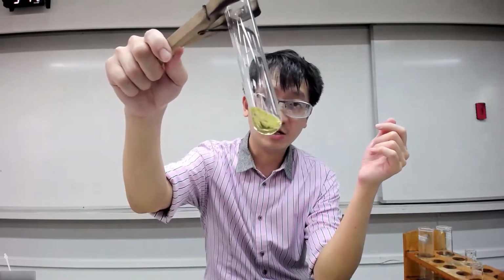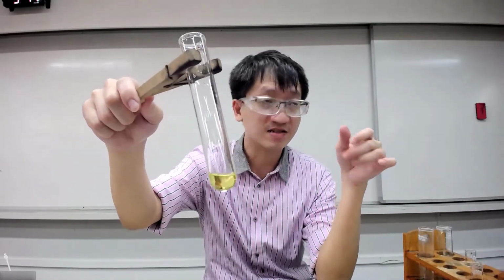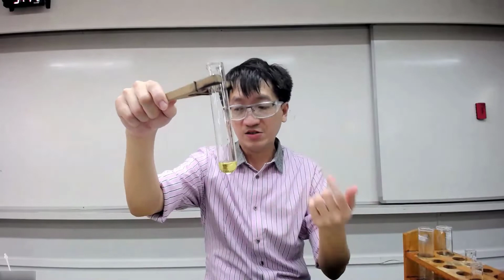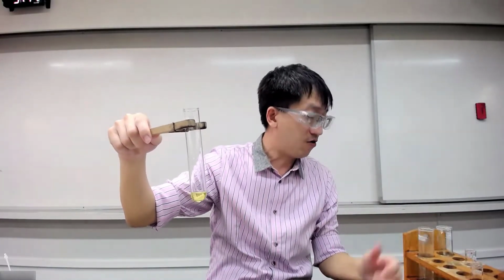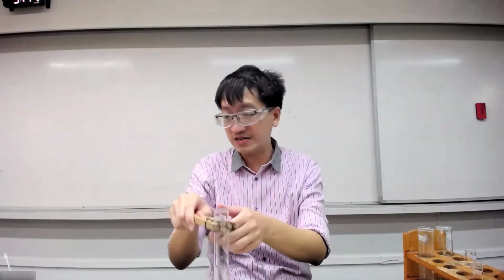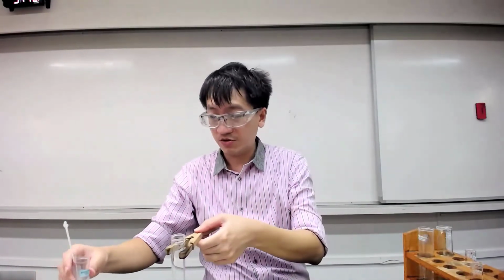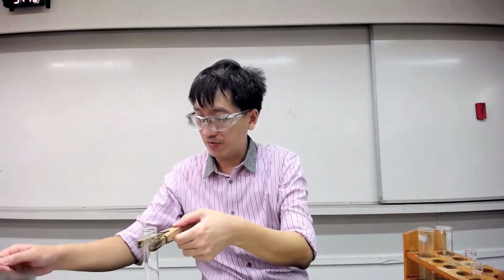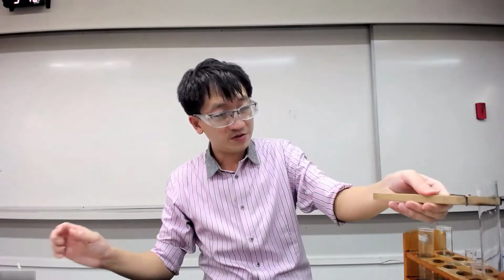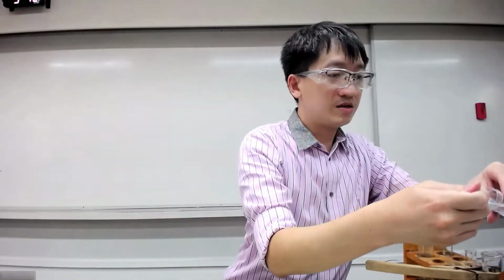I think the yellow filtrate does give you a very clear indication that it is indeed iron(III). The next step, for C part 2, I'm supposed to add some zinc granules. So these are the zinc granules. I'm just going to add some using the spatula, very carefully.